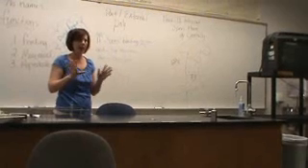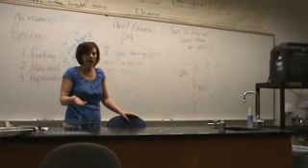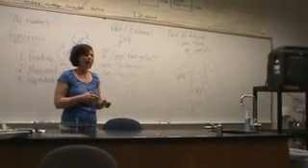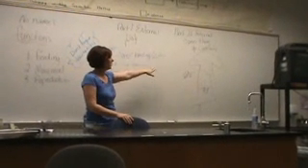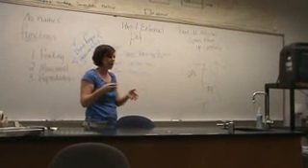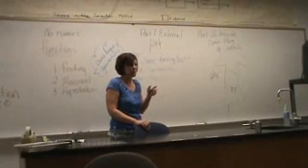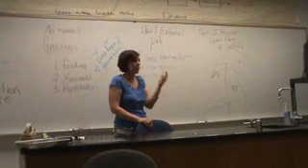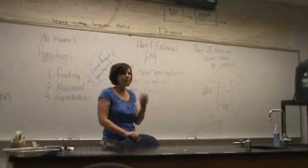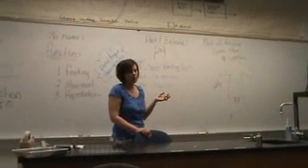And to wrap the lab all up, you say, okay, this is what scientists do when they discover something. If we don't have a living specimen, then we try the best we can with observations. Before you have them open it up, you could say you do have a syringe. We've got some dye over there so that you can do some experiments. If you think something has to do with digestion, well, inject some of the food coloring in there and see where it goes. But again, on the lab concept sheet, we do have labeled diagrams for you, just in case you're curious what the actual names of the organs are.